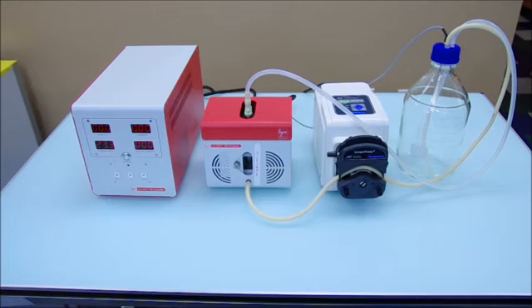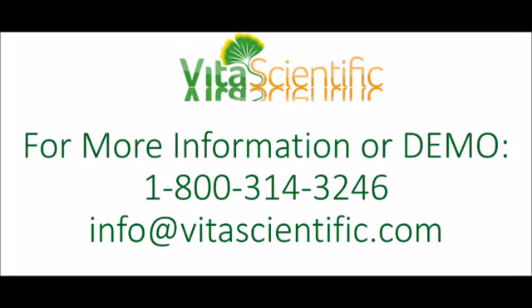In this video series, we will describe each of the X-Clarity components, how to put the system together, and how to operate the system.